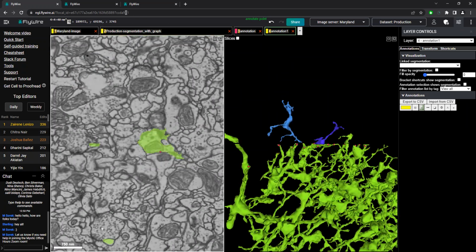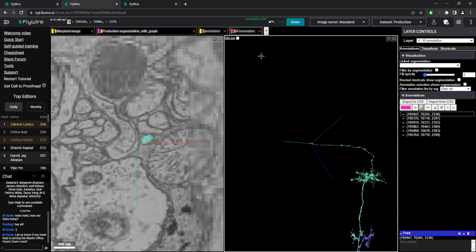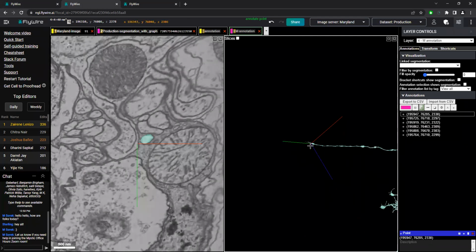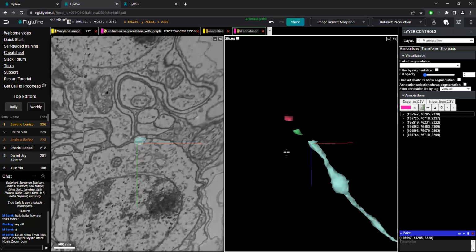So I'm going to jump over to the one that I was going to show how to use a little bit more of that placing annotation points for jumping. This is an example that Ankri had. And at the end here, we have some pretty bad misalignment and shifts.